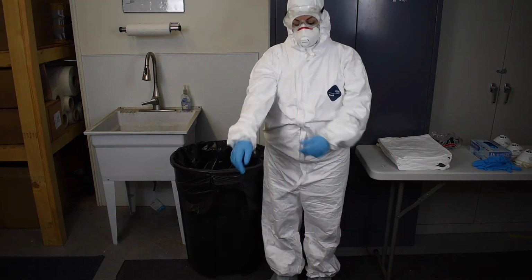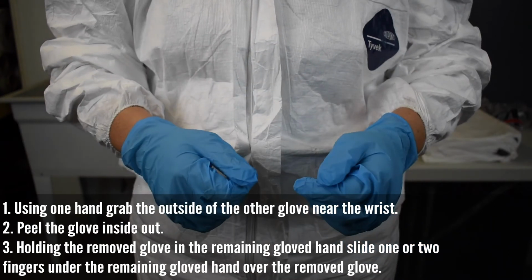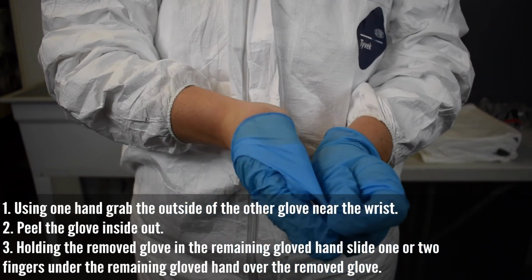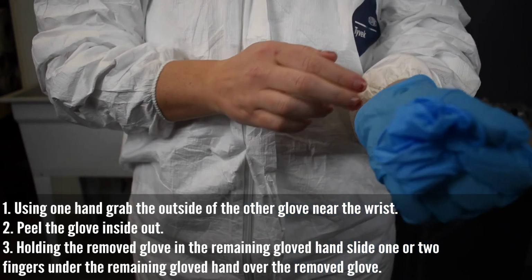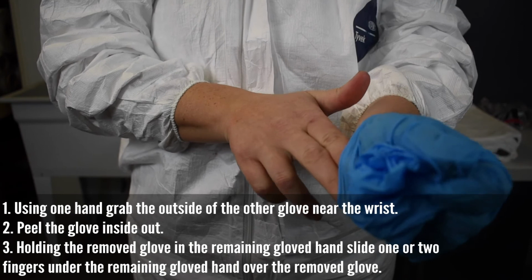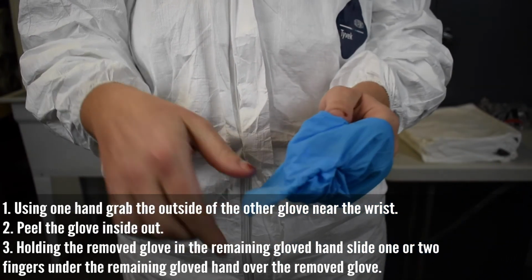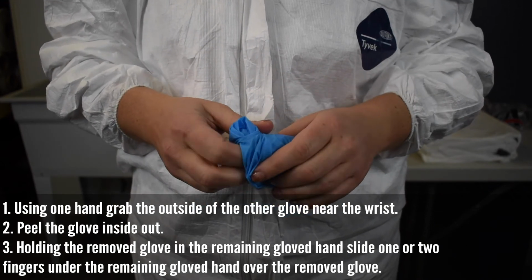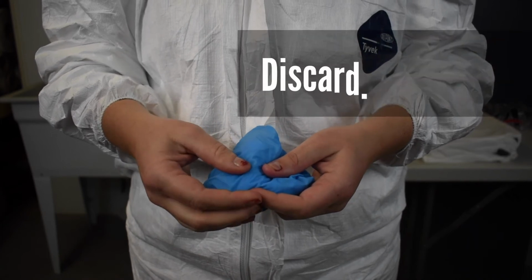Next, remove your gloves using the glove-in-glove technique. Using one hand, grab the outside of the other glove near the wrist. Peel the glove inside out. Holding the removed glove in the remaining gloved hand, slide 1 or 2 fingers under the remaining gloved hand over the removed glove. Peel the second glove off, rolling inside out and touching only the inside of the glove. Discard.